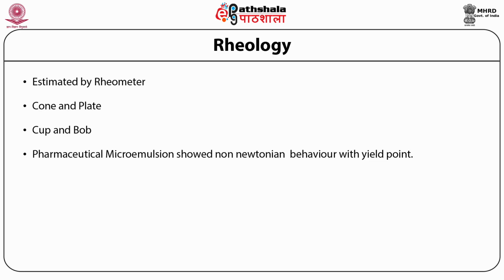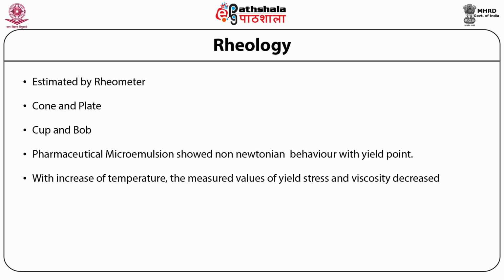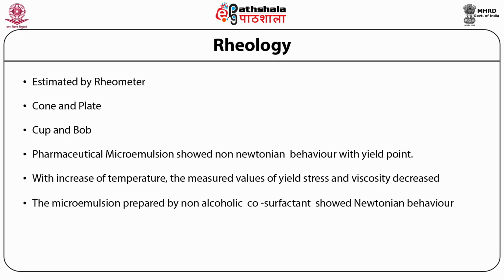Pharmaceutical microemulsions showed non-Newtonian behavior with yield point, whereas with increase in temperature, the measured values of yield stress and viscosity decrease. Therefore, we could say that microemulsions prepared with non-alcoholic co-surfactants showed Newtonian behavior.